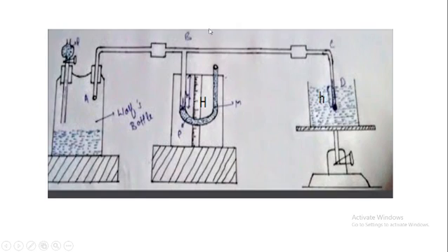So, due to a small pressure there is a greater difference in the manometer's column. You have to determine the height difference in the liquid when the air bubble is formed and escapes or detaches from the tube CD. At that time you have to measure the maximum pressure, that is, the height difference in the manometer tube.